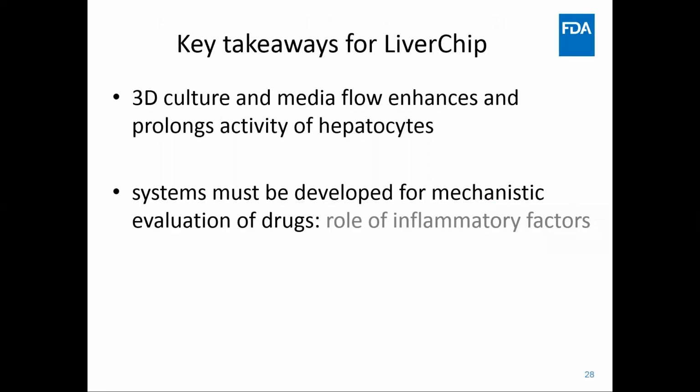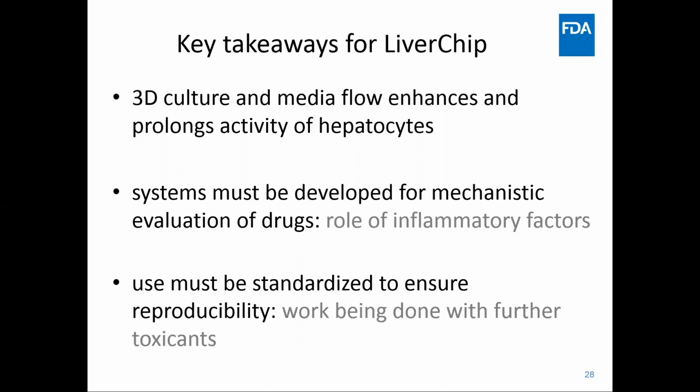The key takeaways for the LiverChip are that 3D culture and media flow enhance and prolong activity of hepatocytes. These systems must be developed for mechanistic evaluation of drugs, as seen specifically for the role of inflammatory factors. And the use must be standardized to ensure reproducibility. And this is work that we will be doing with further toxicants, in addition to the work that we've done already with the developers with levofloxacin and Trovafloxacin.